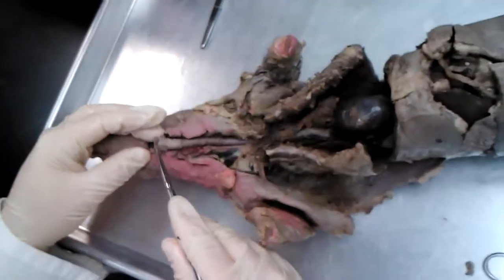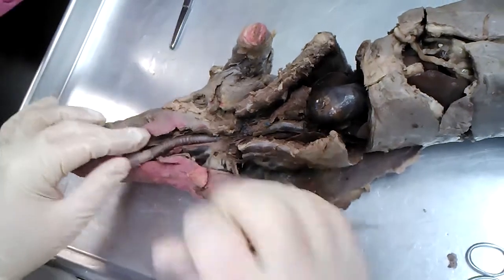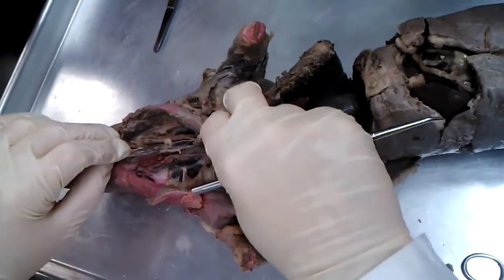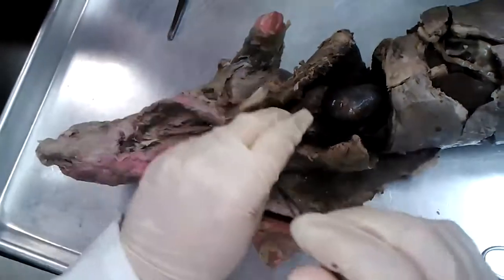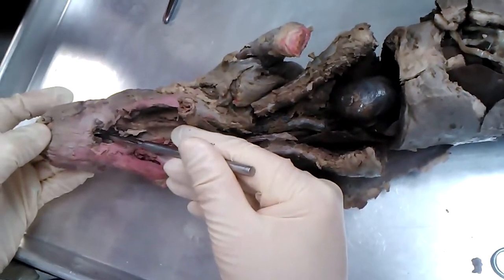You recall before we had right here, this was the larynx, then trachea. Open this up here, pull the trachea out of the way, this brown tube behind the trachea. Right in here, this was the esophagus, all right? Let's pull that back out of the way now. What's left behind this little hole here is the pharynx in that area.